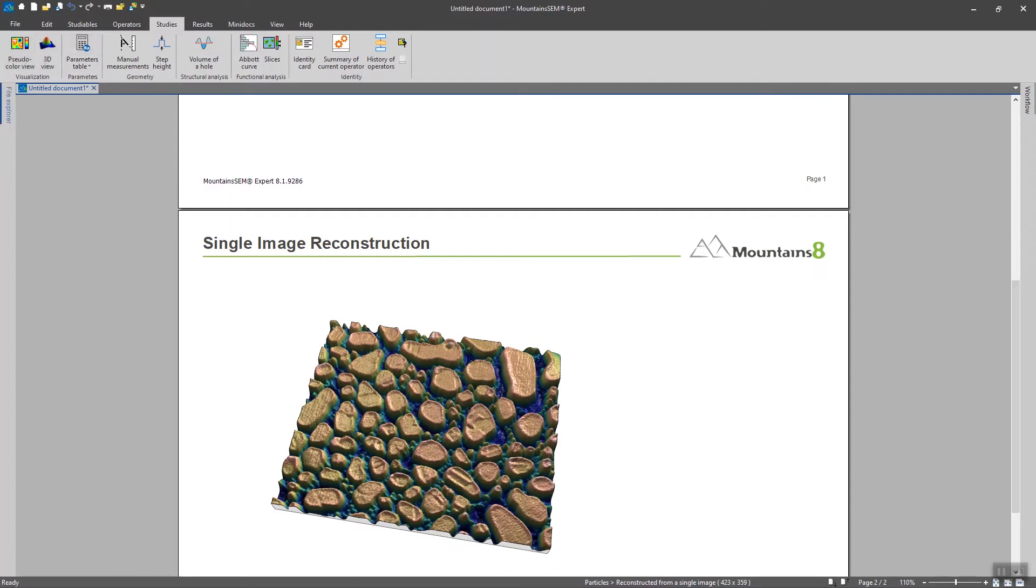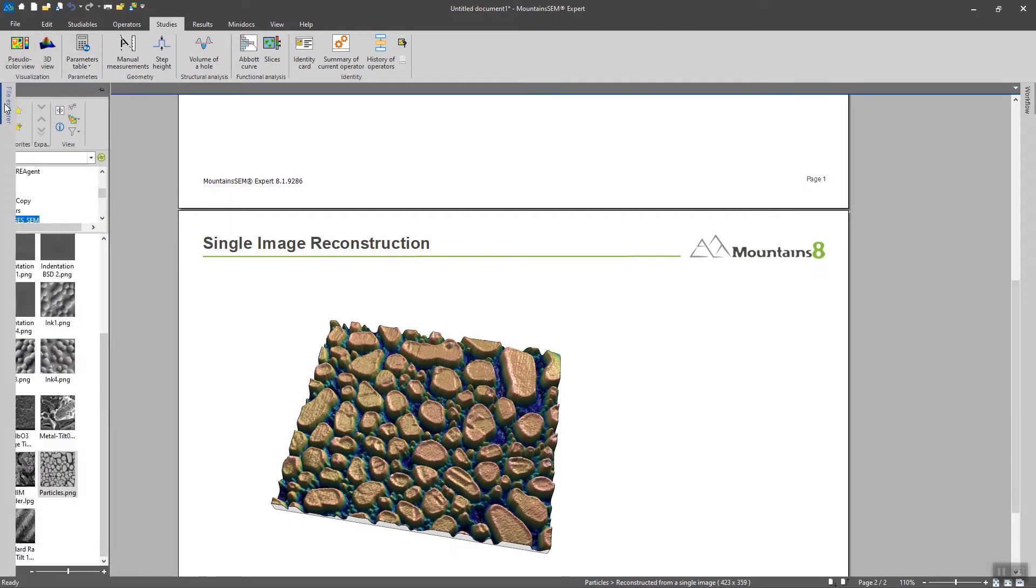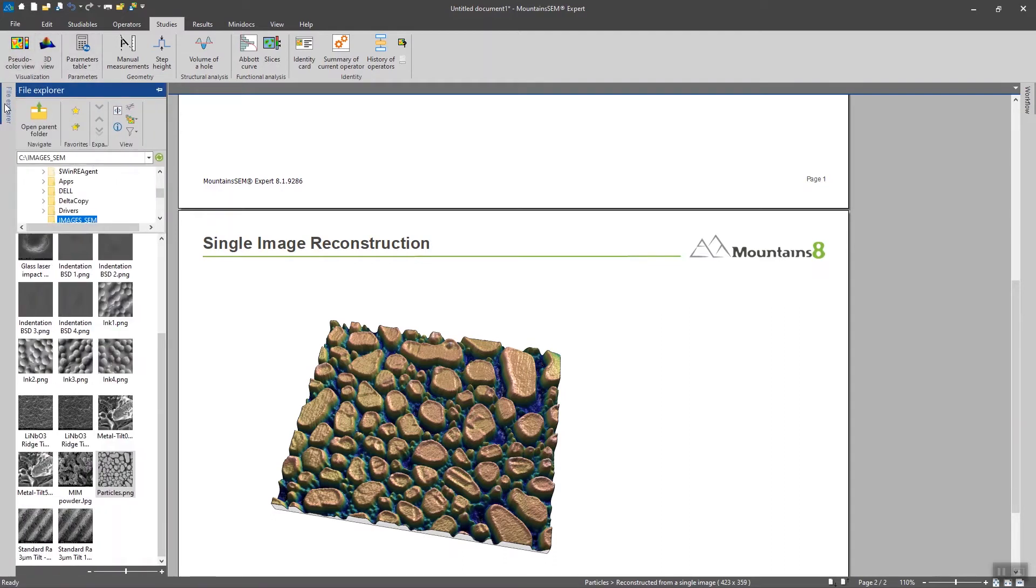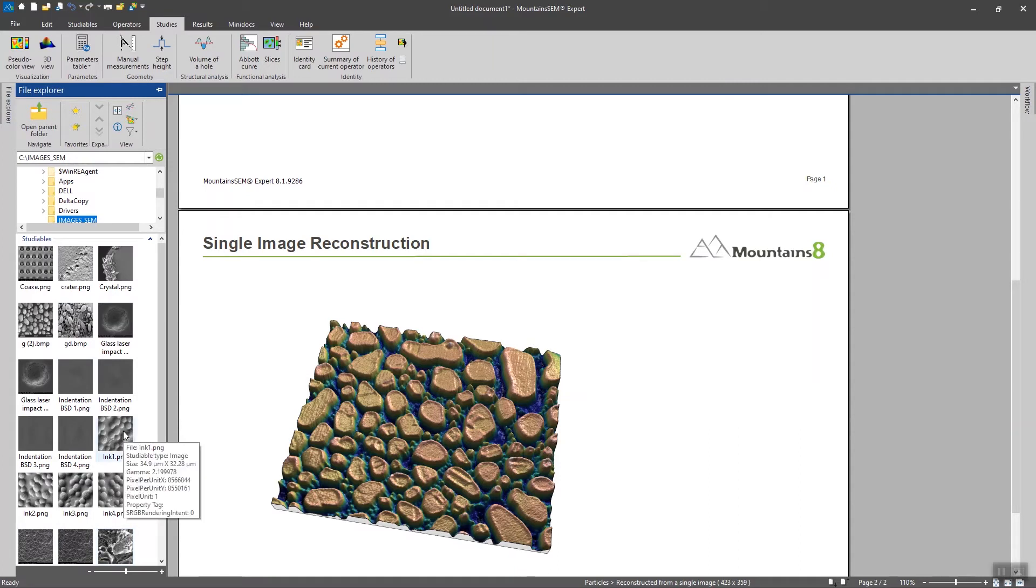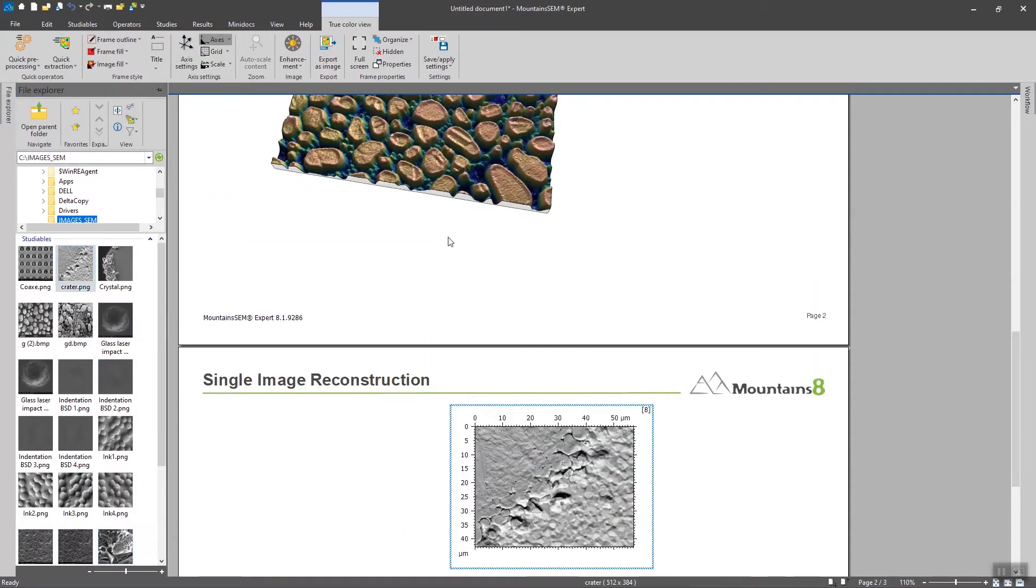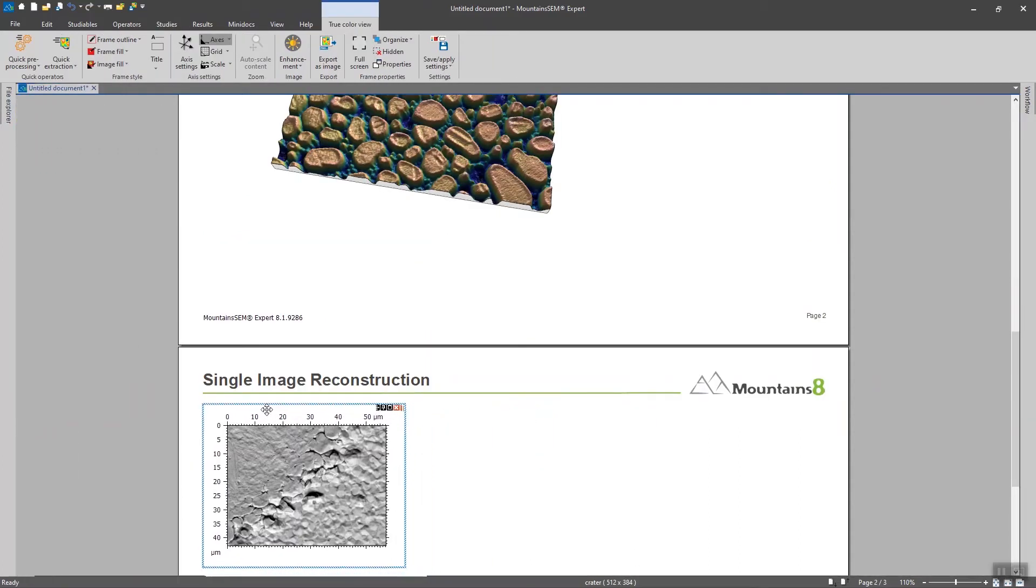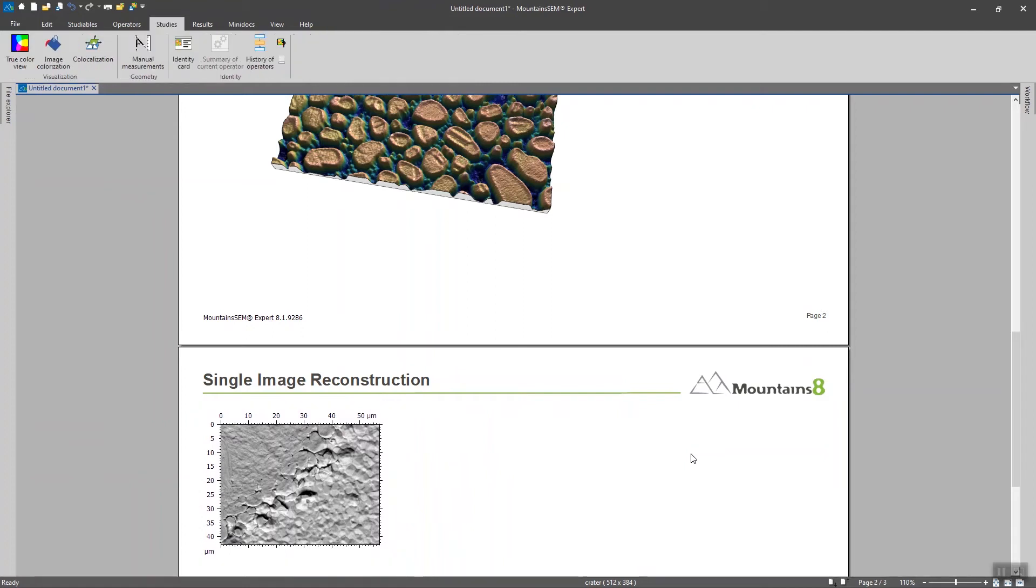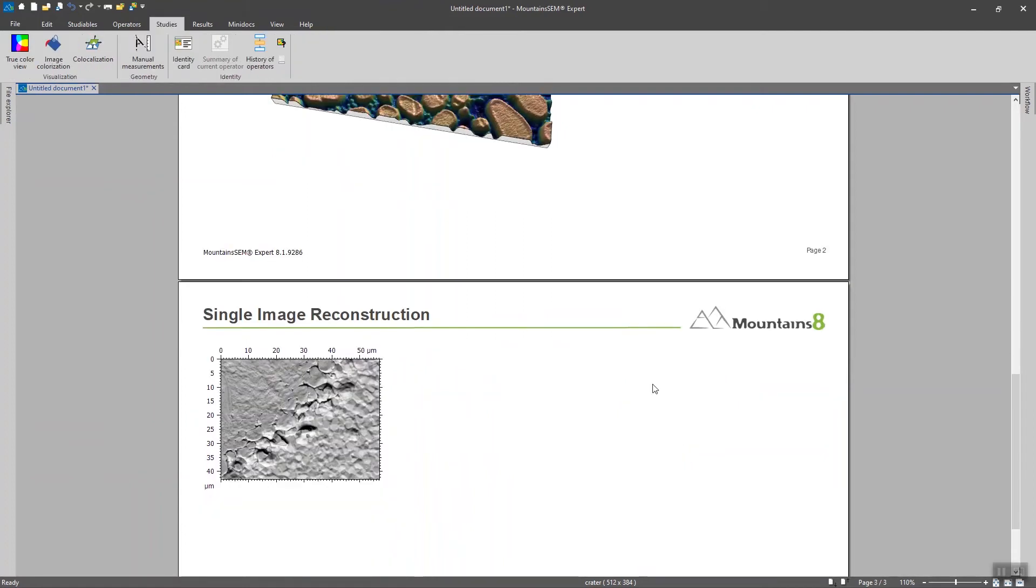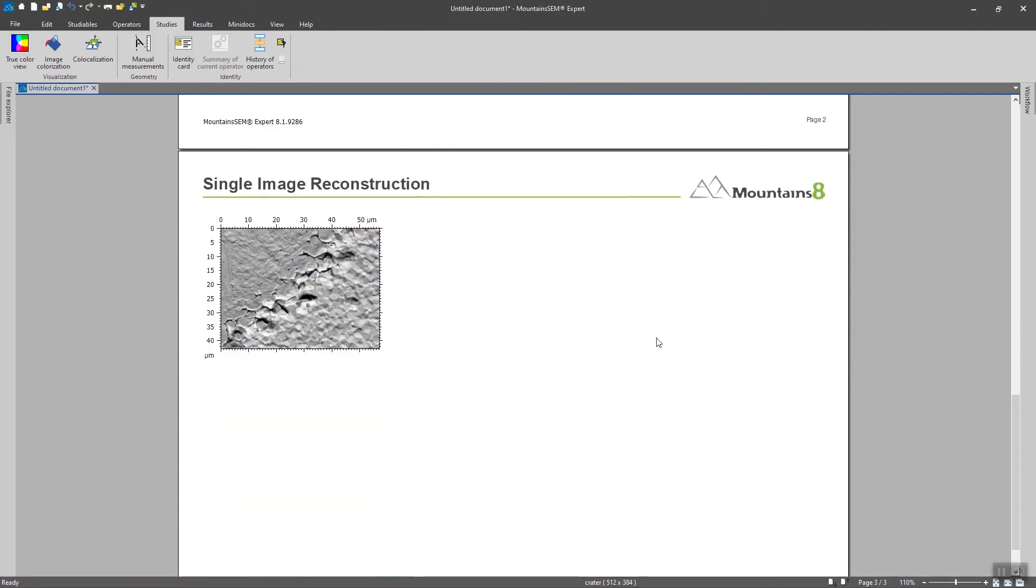Now we are going to load another image and explore another technique that Mountains SCM gives us and this time we are going to use the shape from shading technique. You know the one that we were using with the four quadrants but except that this time we are going to apply it only on one image.